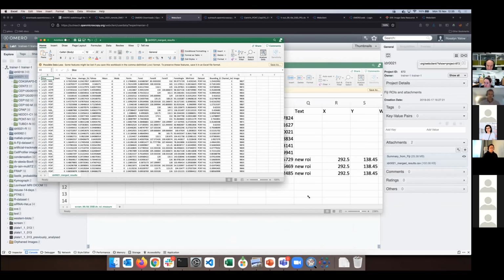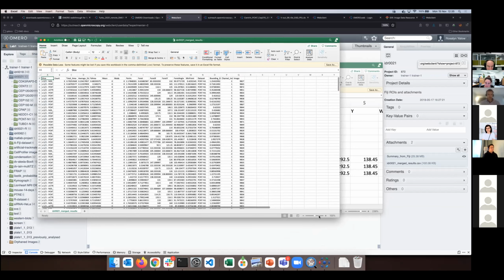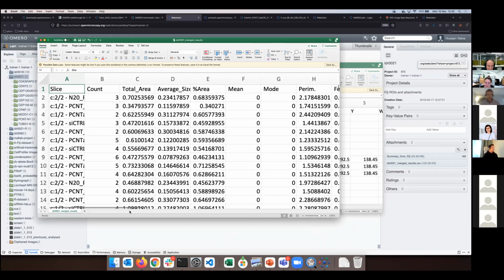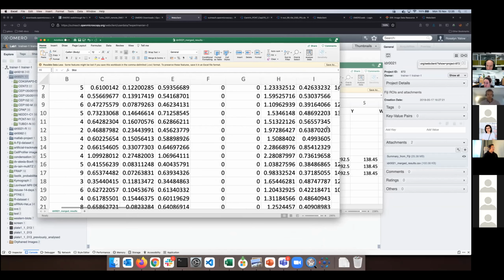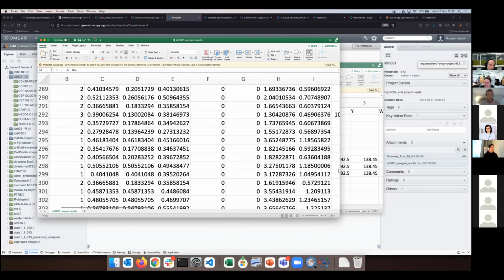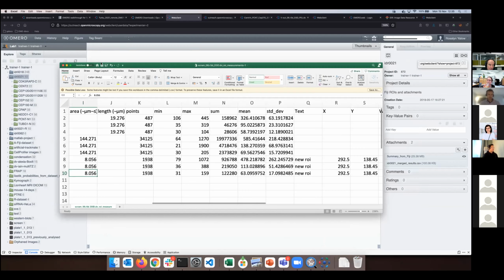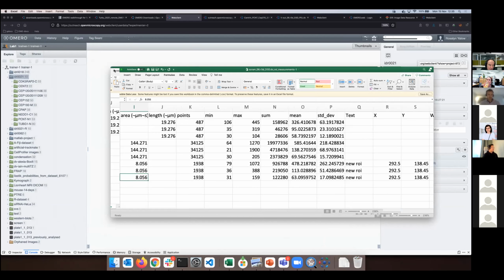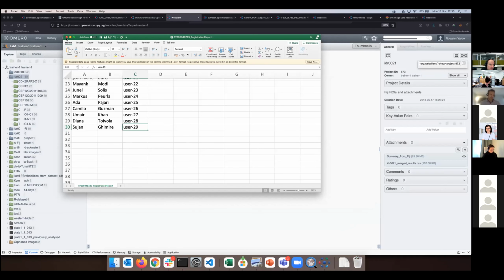That's the CSV I'm just showing right now. With all those varying columns, the Feret X, etc., and it has 414 rows. That's quite a bit of secondary metadata. Let's call it the analytical results, which are coming from the secondary analysis run on images. Again, the images were in Omero during the analysis.